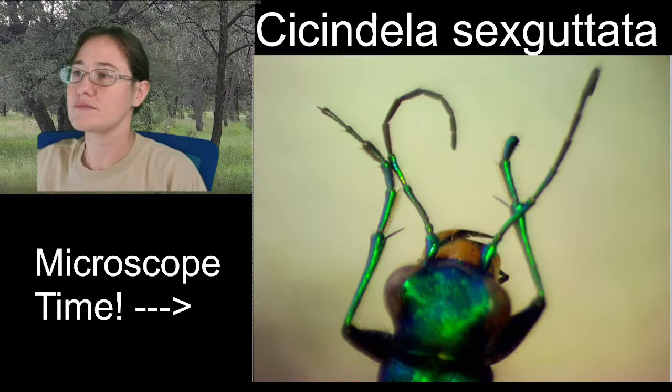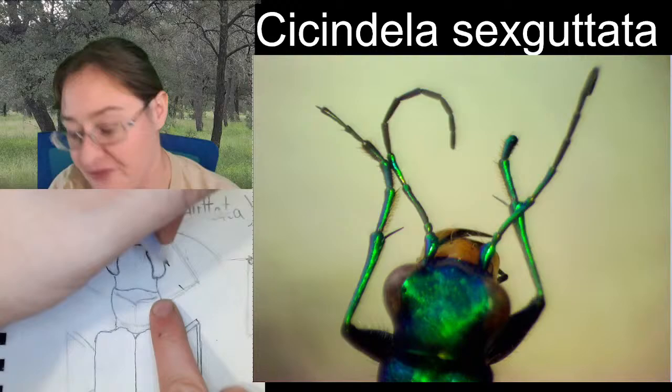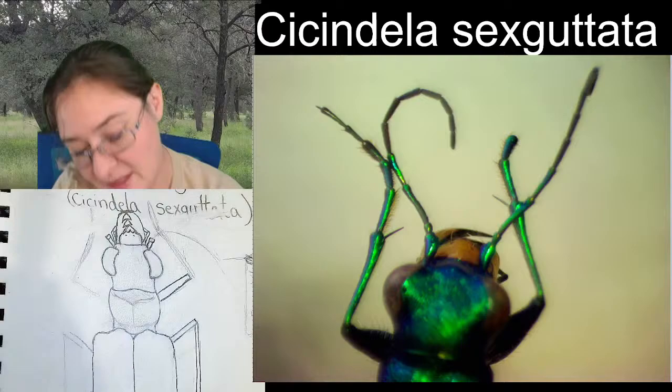So our front legs are coming out of the front of our pronotum. If we look where our head and our pronotum connect, our femur comes out right about here. Right about there. Our tibia is going to be coming up.